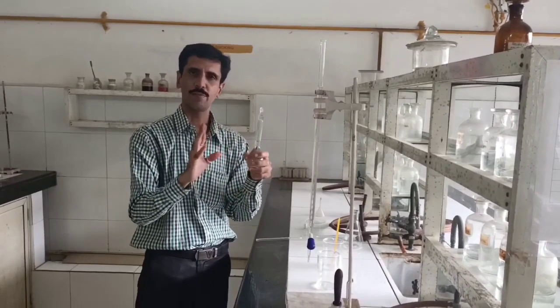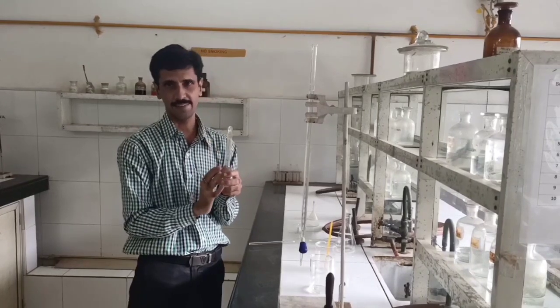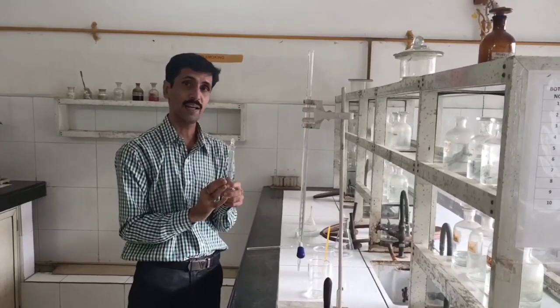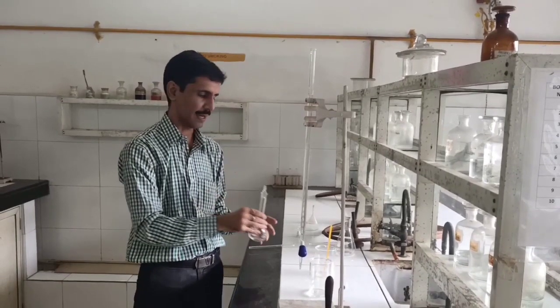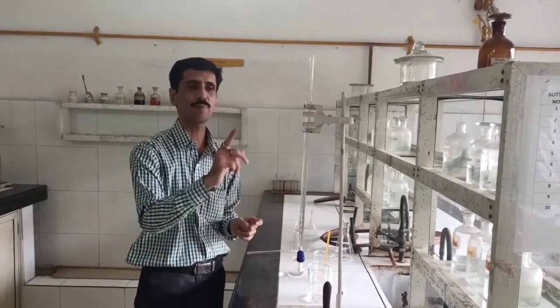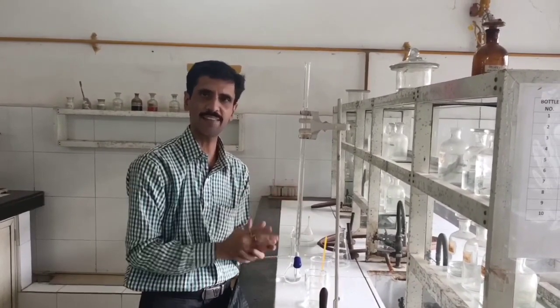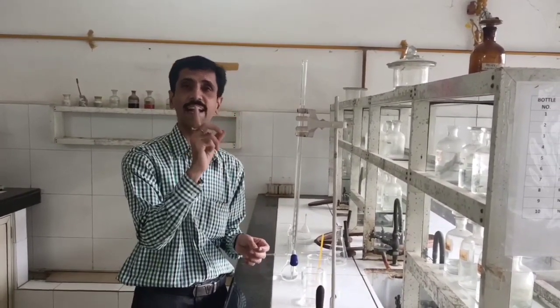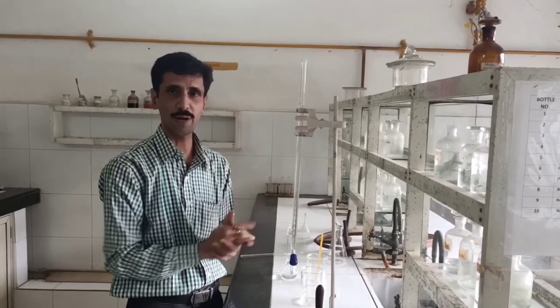Okay, with that, I hope you have understood. This is also called a primary standard. So how much have we prepared? Yes, it's 0.1 normal. Now this has to be titrated against NaOH. This is the supplied NaOH whose exact normality has to be determined. So that is being filled in the burette up to the zero mark.